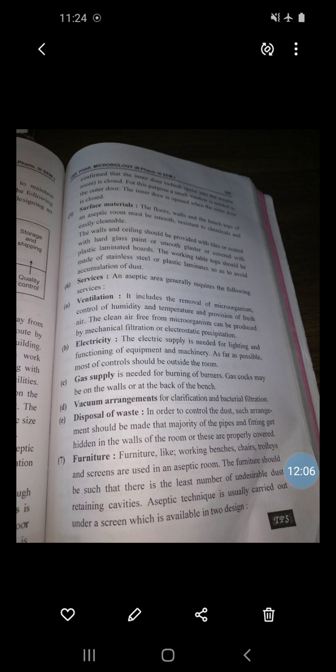This type of screen has two armholes on the front side through which the worker can introduce his hands for doing various aseptic techniques, and the UV tubes are fitted inside the screen in order to maintain the sterility inside the cabinet. Then fume cupboard type.